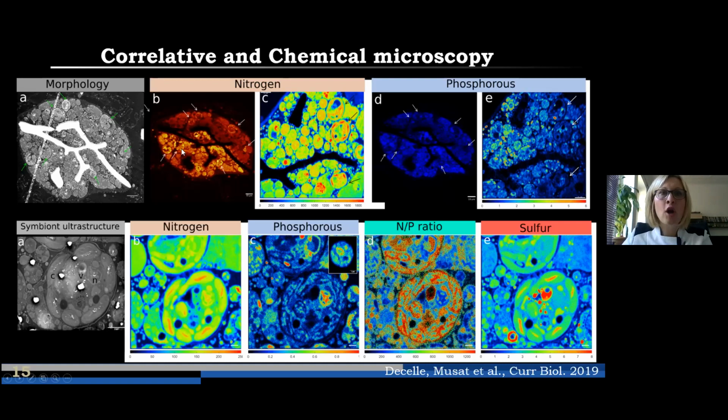And we performed on B a TOF-SIMS imaging of the very same area, looking particularly at nitrogen mapping, followed by a nanosims analysis, which is C and E. And down, it's the same picture. So as I mentioned, with the nanosims, you can get isotopic ratios, and then you can map this within one cell.